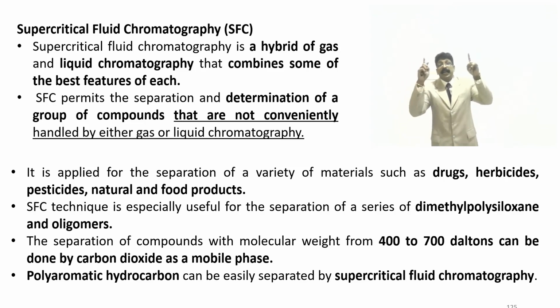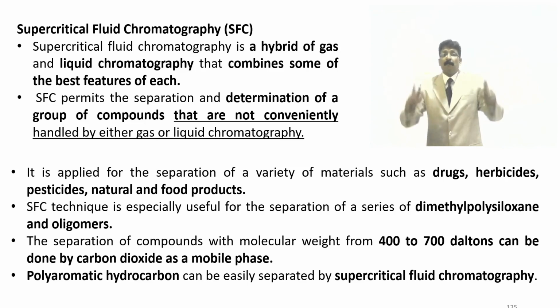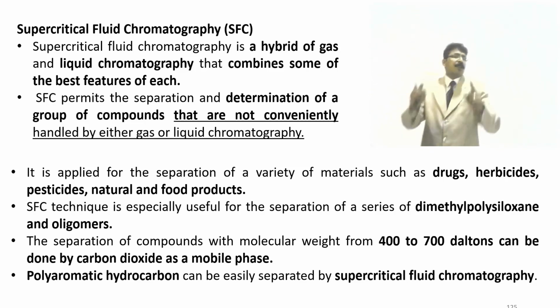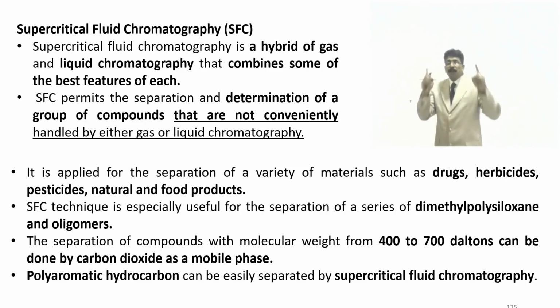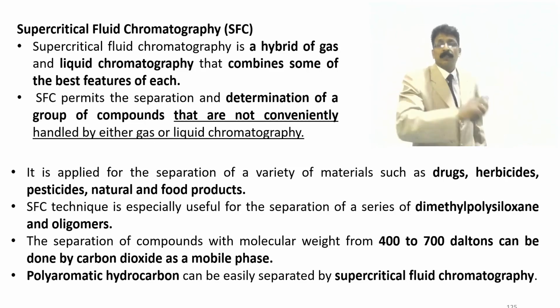Polyaromatic hydrocarbons can be easily separated by supercritical fluid chromatography, which were very difficult or impossible to separate in HPLC and gas chromatography.